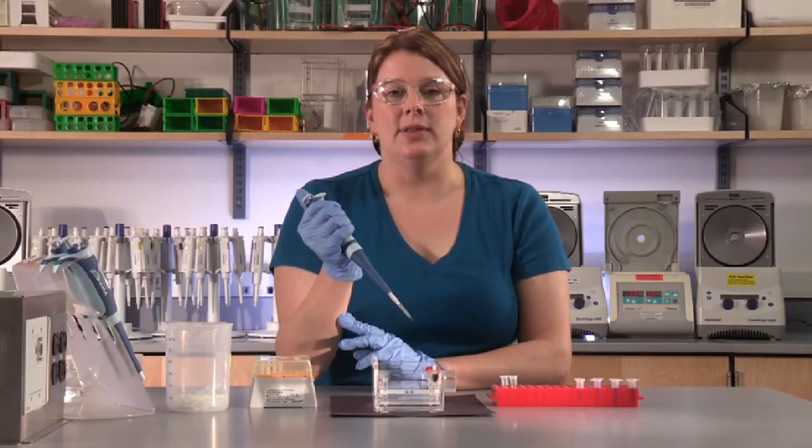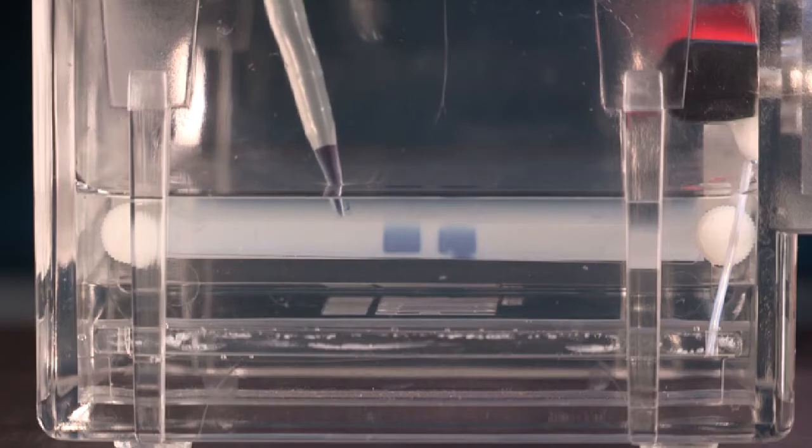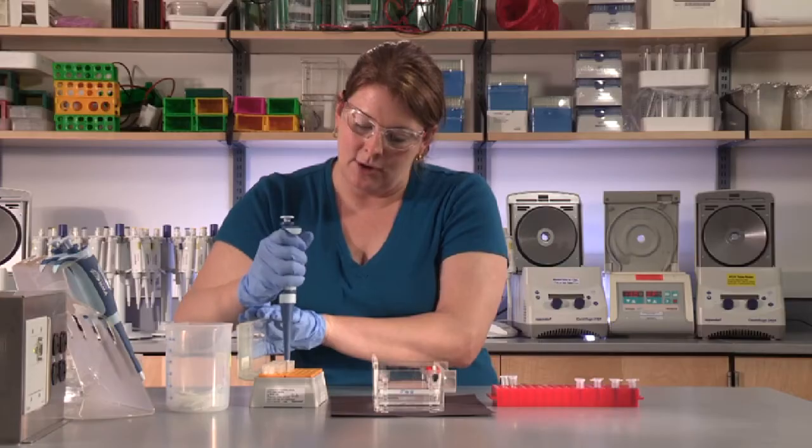A common mistake when loading a gel can be when you dispense the sample. You just want to go to the first stop. Sometimes if you over press to the second stop, this will create air bubbles causing the sample to leak out of the wells.